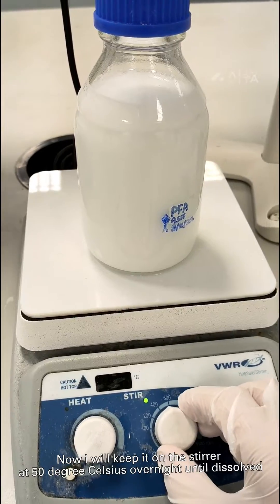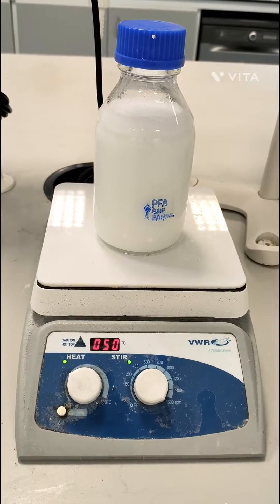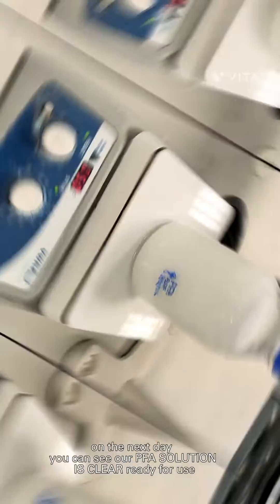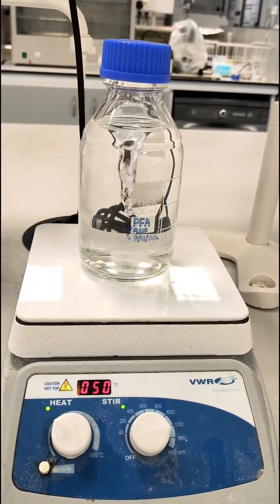Now I will keep it on the stirrer at 50 degrees Celsius overnight until dissolved. On the next day you can see our PFA solution is clear and ready for use.